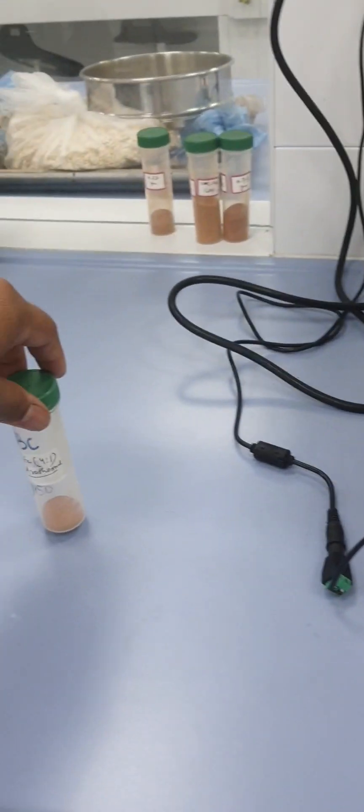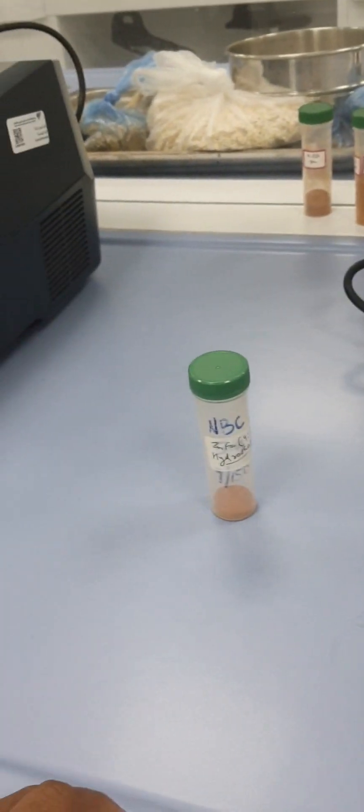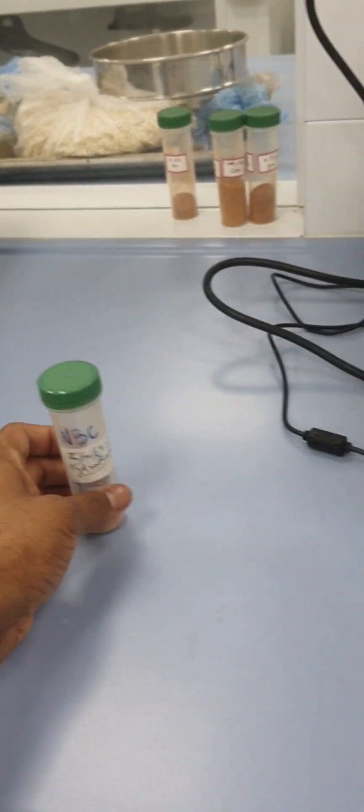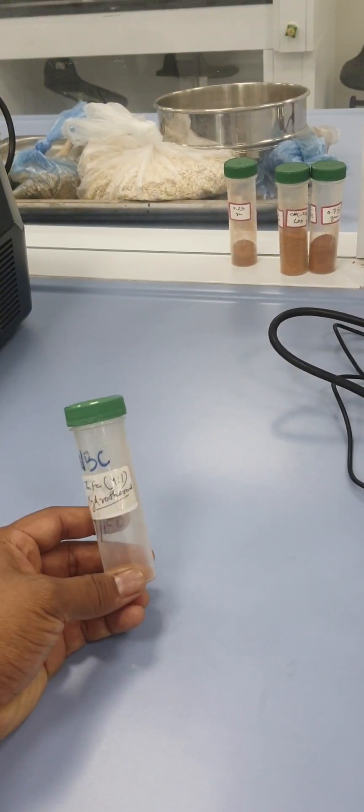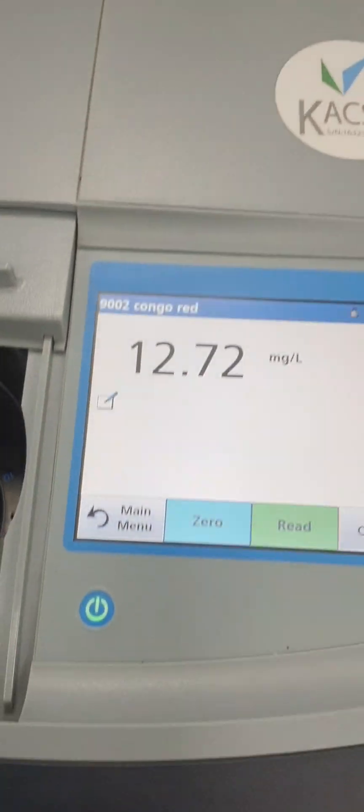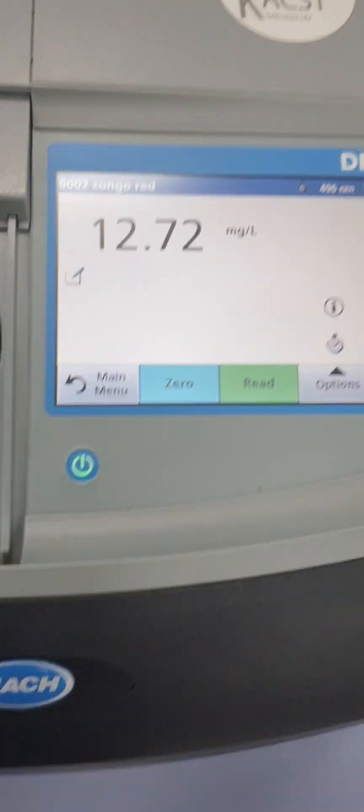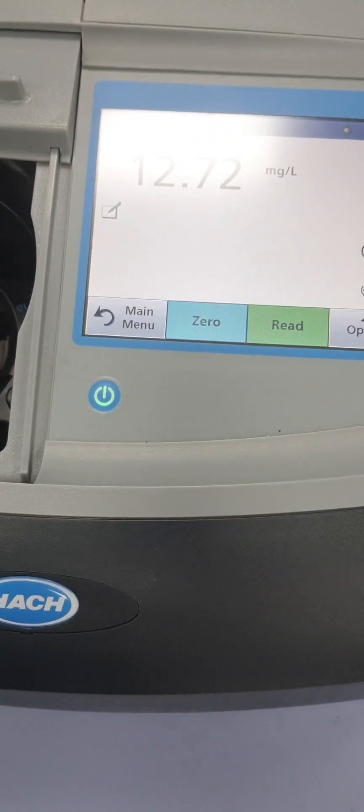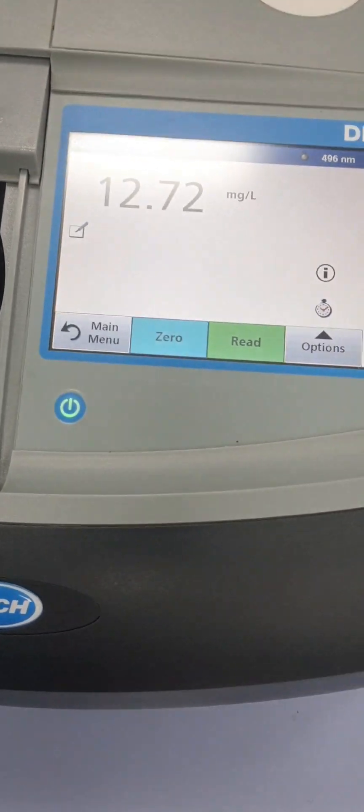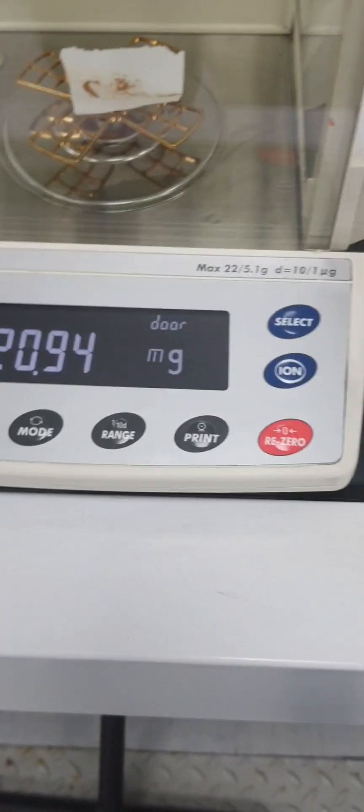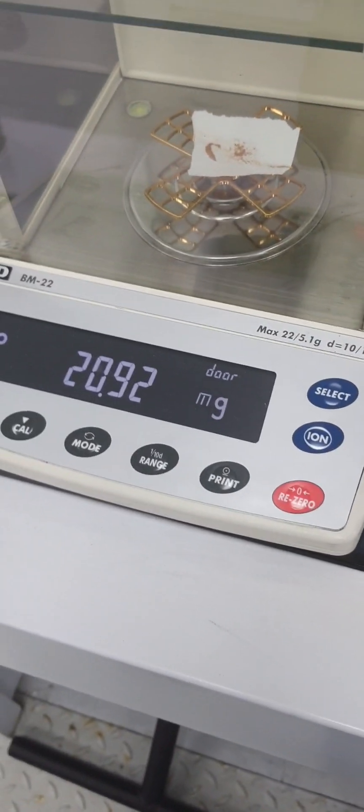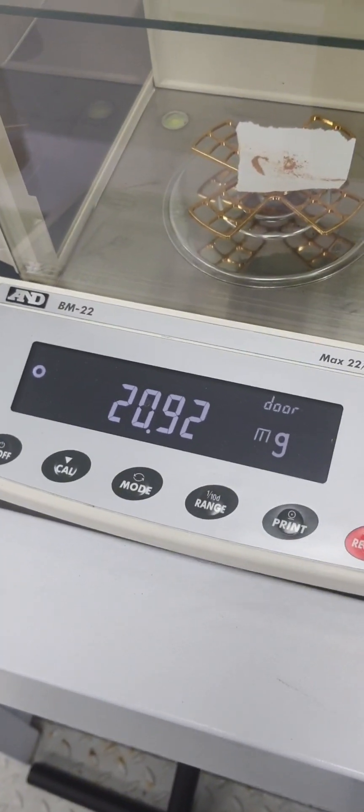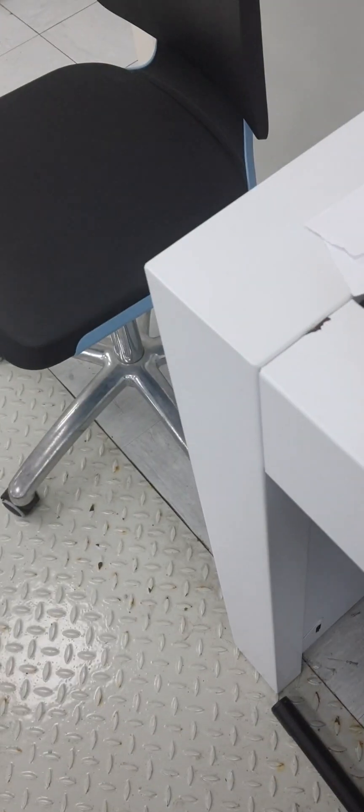Today I have chosen the Congo red dye which is here. First of all, the task is to measure the concentration of it, then we will do each step-wise and also we will see the band gap. Here we have the zinc iron 4:1 LDH which is prepared by hydrothermal process. The concentration of the dye is around 12.72 ppm.